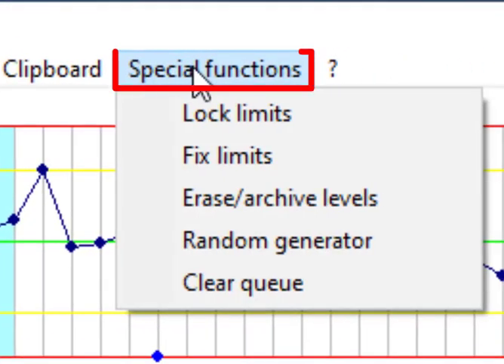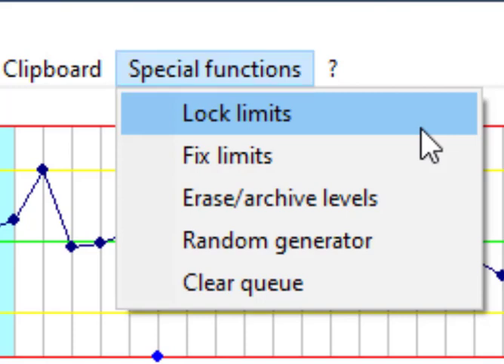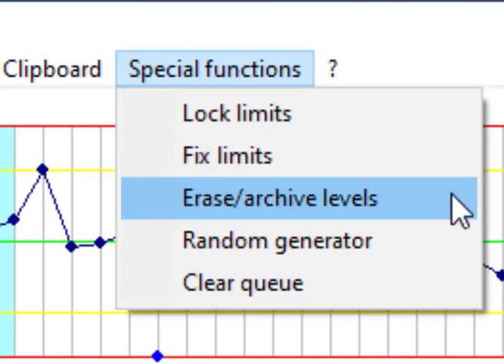Special function is one of the most important parts of this software. By using this part we can lock limits. We can fix them but we do not use fixed limits in medical laboratory. We can erase archive levels.